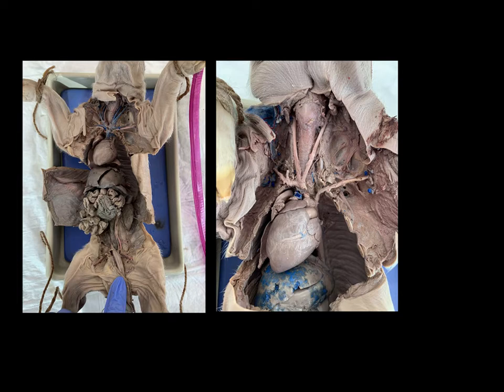We also have a brachiocephalic artery, just like we had a brachiocephalic vein, and the brachiocephalic artery is this structure right here. Now it looks like it was cut during the dissection, but this vessel right here is the brachiocephalic artery. Right here, where the left subclavian artery and the brachiocephalic artery empty into this larger vessel, this is the aorta.